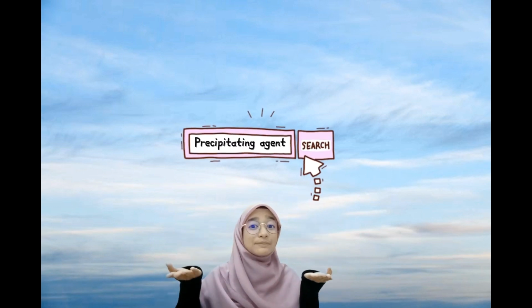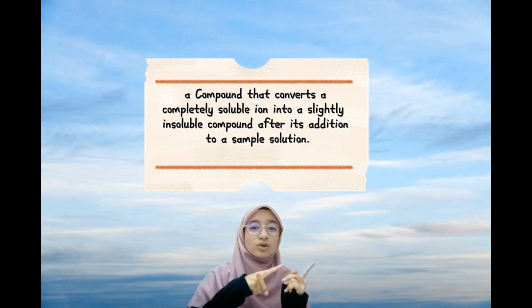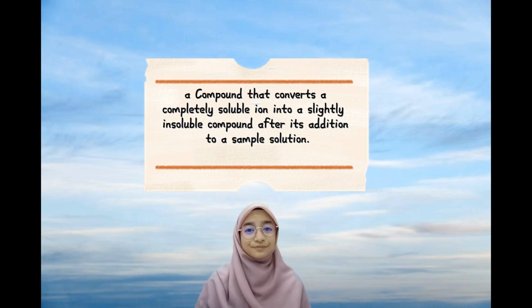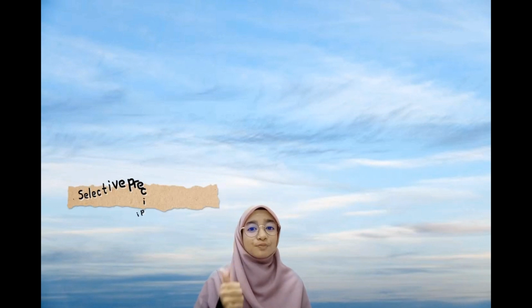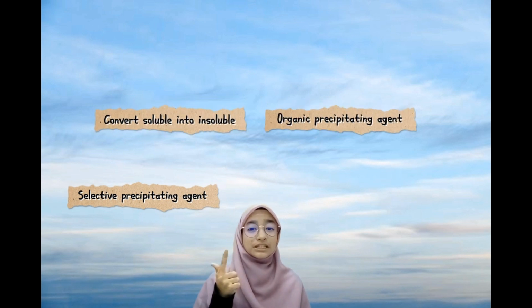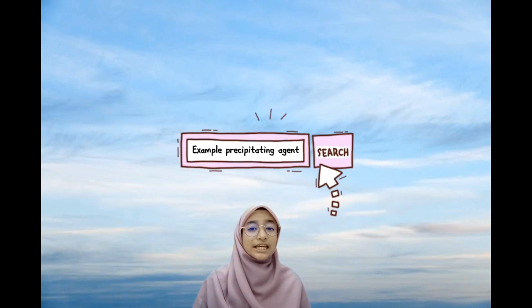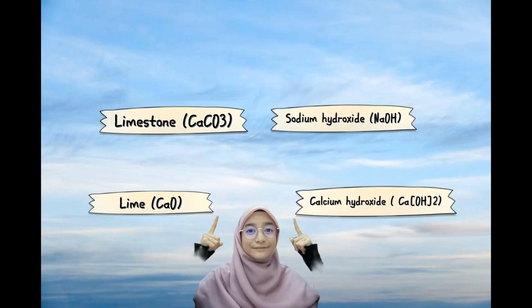The substance used to react and form the precipitate is known as the precipitating agent. What is a precipitating agent? A precipitating agent is a compound that converts a completely soluble ion into a slightly insoluble compound after its addition. There are 4 criteria of a precipitating agent. The first one is selective precipitating agent, convert soluble into insoluble, organic precipitating agent, reproducible stoichiometry. Examples of precipitating agents are calcium oxide, calcium hydroxide, and sodium hydroxide.